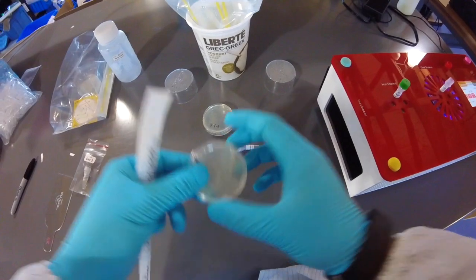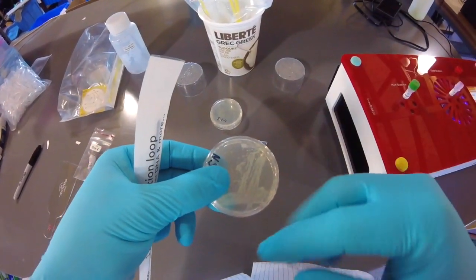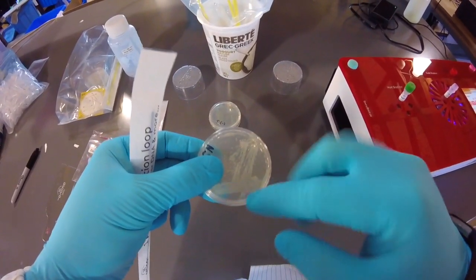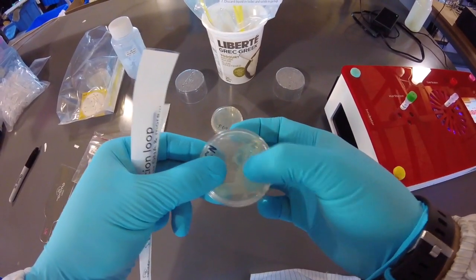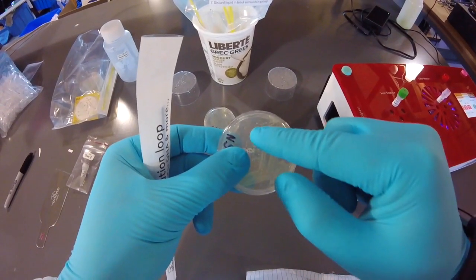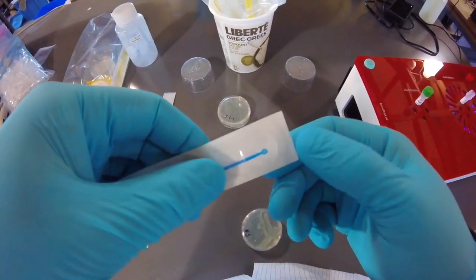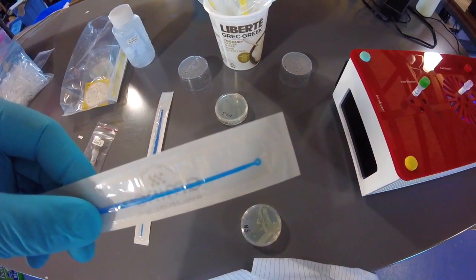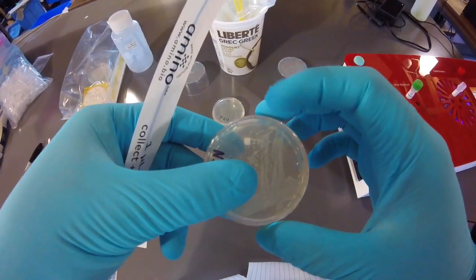All right, so we're going to be collecting some colonies because, again, they grow fast and they take up DNA the best. So you want to avoid the lawn areas here. A lawn is where you have this solid growth of cells, all right? So we're going to avoid that. So we're going to try and collect maybe some of these small colonies right here, maybe some of these up here. But really what you need to do is collect enough cells so that the center of your little blue loop end here is full of cells. So you don't need that many cells. And when you look at this, actually maybe 1 or 2 colonies would be fine.